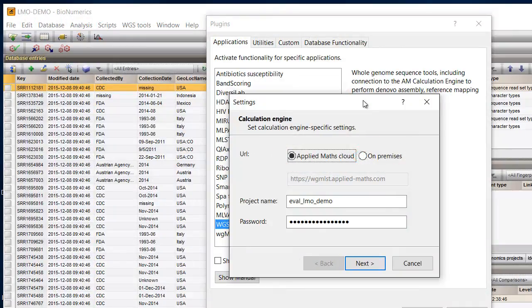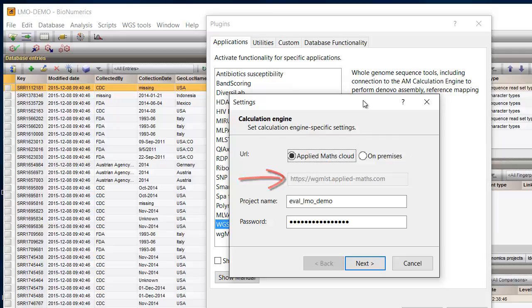To connect to the calculation engine, you need to define the URL of the Applied Maths Amazon Cloud or a locally installed instance. And you need a project name, as you obtained from Applied Maths and the corresponding password. In this case, I will use the cloud setup.